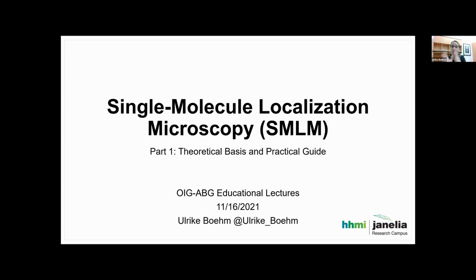The other part is focused on the recent advancements of single molecule localization microscopy which have been realized here at Janelia. But let's start with the first part about the basic principles, which should also give you some practical hints about how to structure your single molecule localization microscopy experiment.